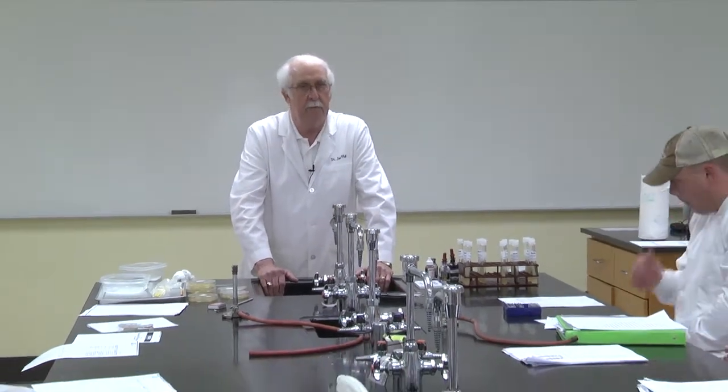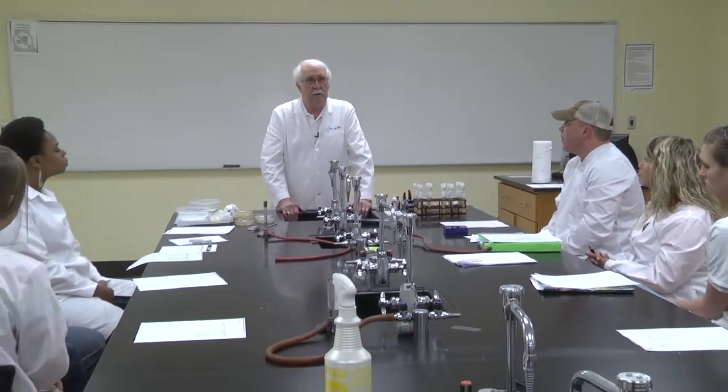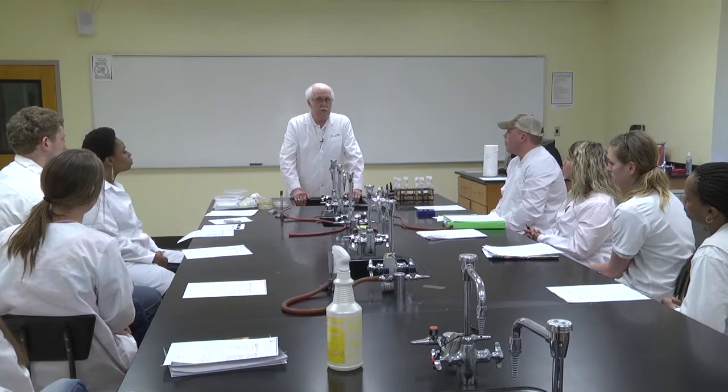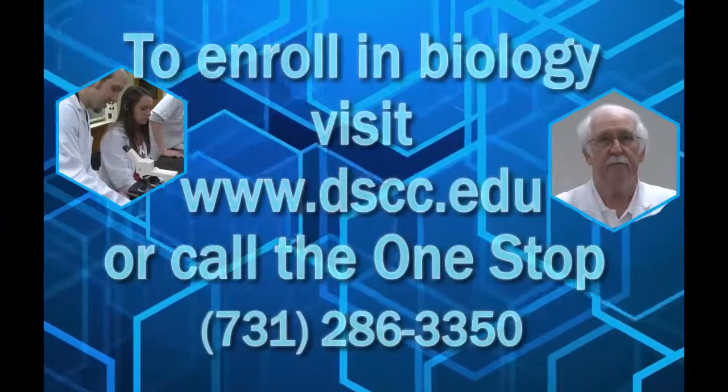Then this will be coming up again. Later we'll be doing unknowns, and this will be the first step among many steps. This only determines the morphological characteristics. We would follow this up with biochemical characteristics.